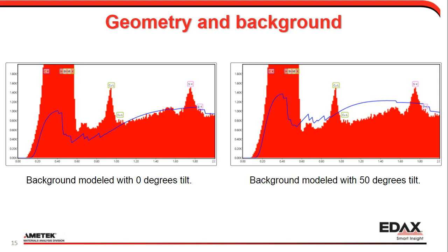So we have quite a few things in here. There's some tin, and there's copper, there's carbon, and various other things. Each of those will give you a jump. And when you go below that, you get that increase in the background. That's what we're seeing here. And you don't see that in the high energy range because absorption is not as pronounced in the high energy range.